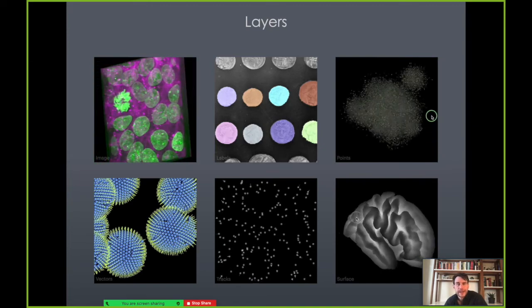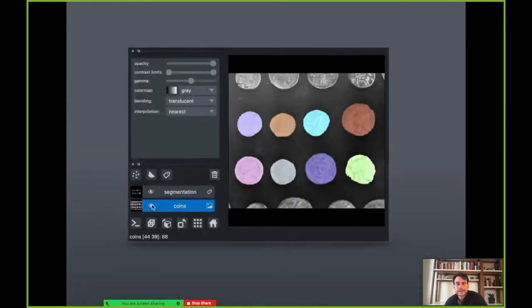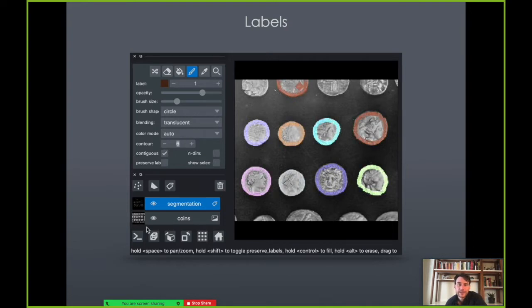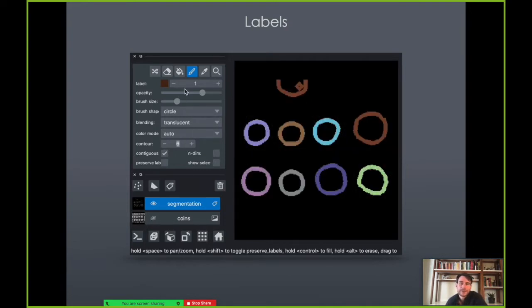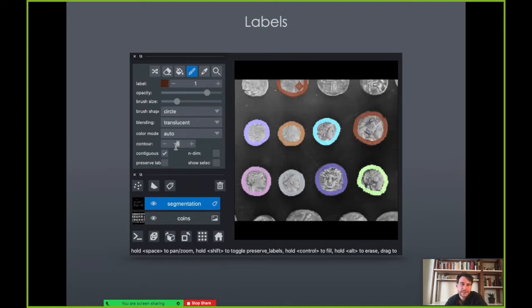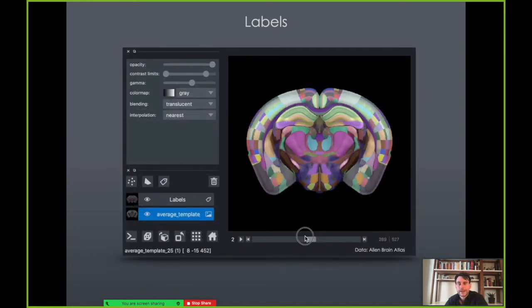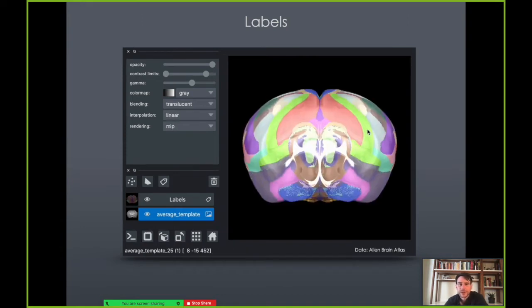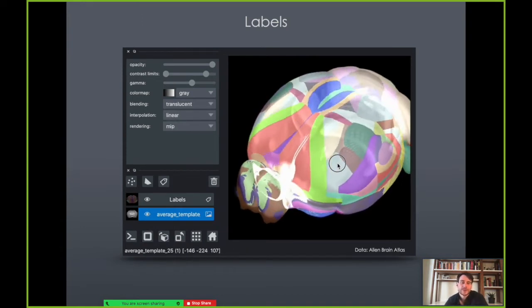Looking at the labels layer type, it's possible to paint, fill, and view the boundaries of labels. This is very useful for segmentation — you may have a cell segmentation or another type of segmentation mask that you want to represent and edit. You can also have an anatomical map, like one from the Allen Brain Atlas where individual regions have labels, and view it in 2D and 3D as well.